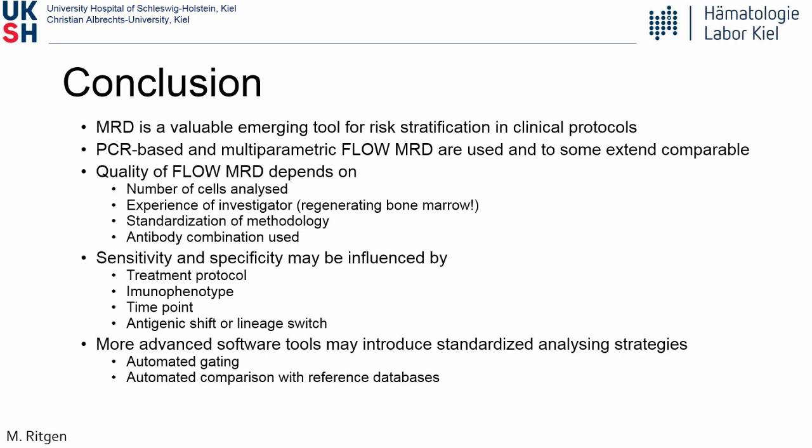So if you follow the Euroflow panels, you should at least have a sensitivity of 10 to the minus 4 and a little bit below. If you have your own panel or other combinations, or you just change the colors, and this is, I think, quite important. If you think, well, the Euroflow panel looks quite nice, but I rather use brilliant violet colors or dyes than the published ones, then you change the assay and the sensitivity level or reference level will change, and you have to assess it on your own. Okay.